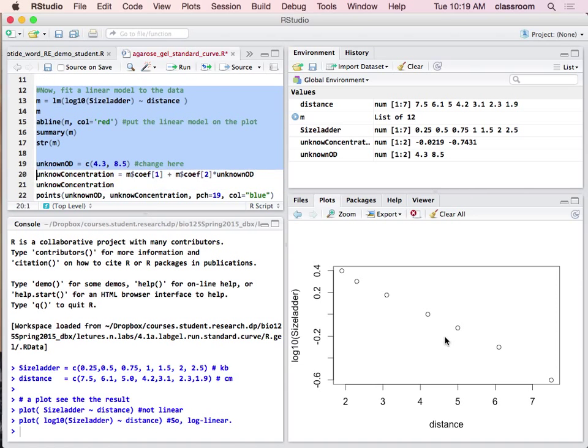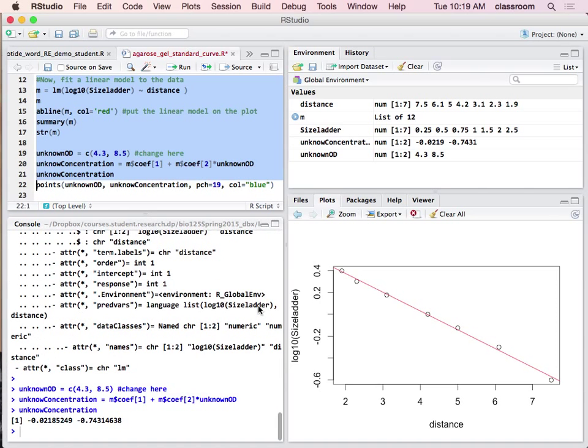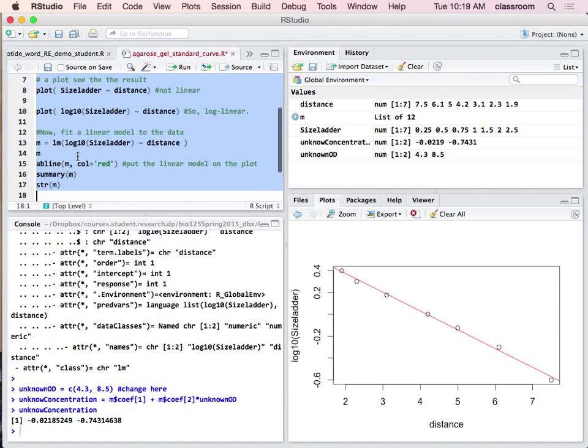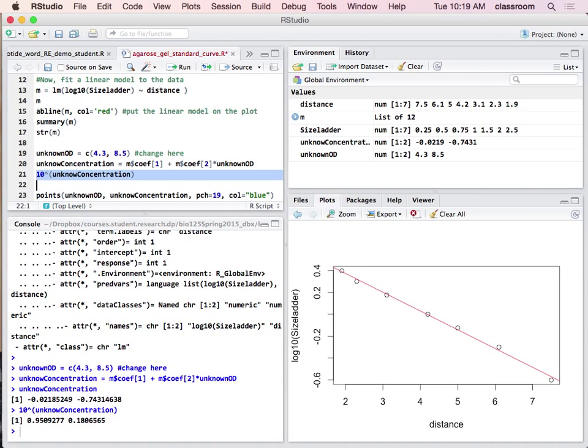So let's say there are two unknown nodes — distances of 4.3 and 8.5 cm. We find the unknowns from the log-linear curve. After rerunning the calculation correctly — remember it's log-linear, so you need to raise to the power — the result comes out to 0.95 kb. It's not 0.8; it's 0.95. A different one comes out to 0.18 kb, if you really want to be more accurate.